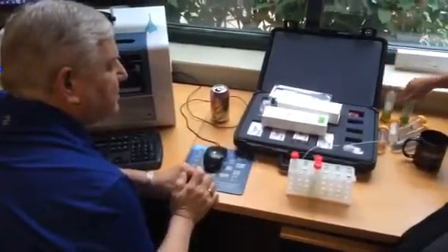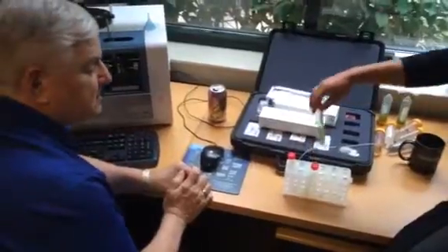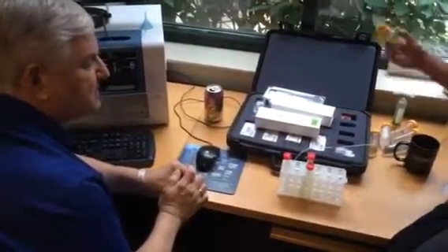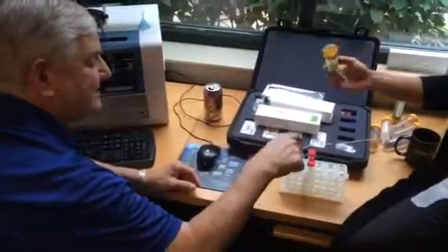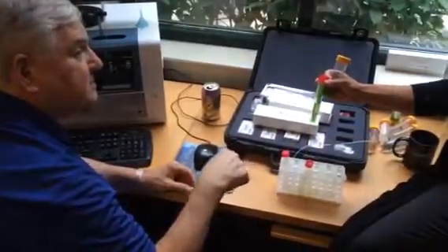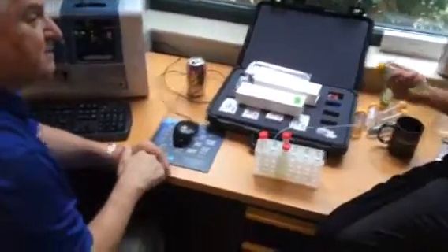Let's stay with what we had so we can get comparisons. You want to do C again? Yeah, we did bag C before. So let's do C again. We already did that one with the filter, but that's at 50, and we want 100. We could run that, and it would be fine, but we inevitably filtered out a lot of the longer filaments. Let's do it again.